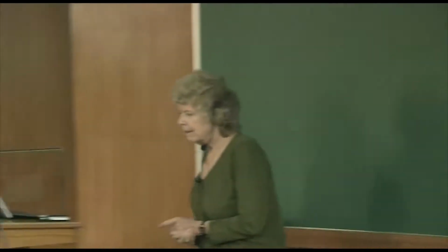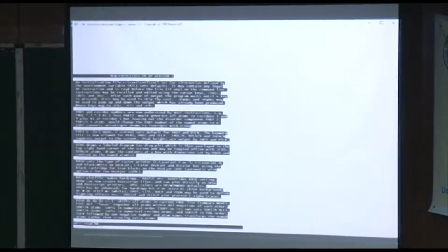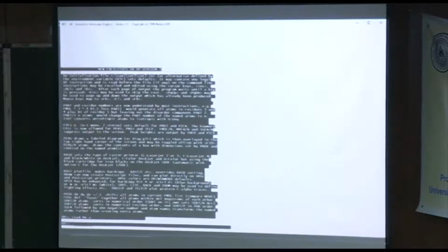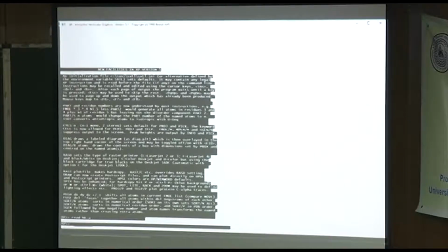Okay. So I want to read, let's just read the file that's called HK minus, or underline A. Oops, I forgot the R, the D. Still, you don't see anything, because there's one more thing you have to say, which is fmol, F-M-O-L, which sets up the connectivities.